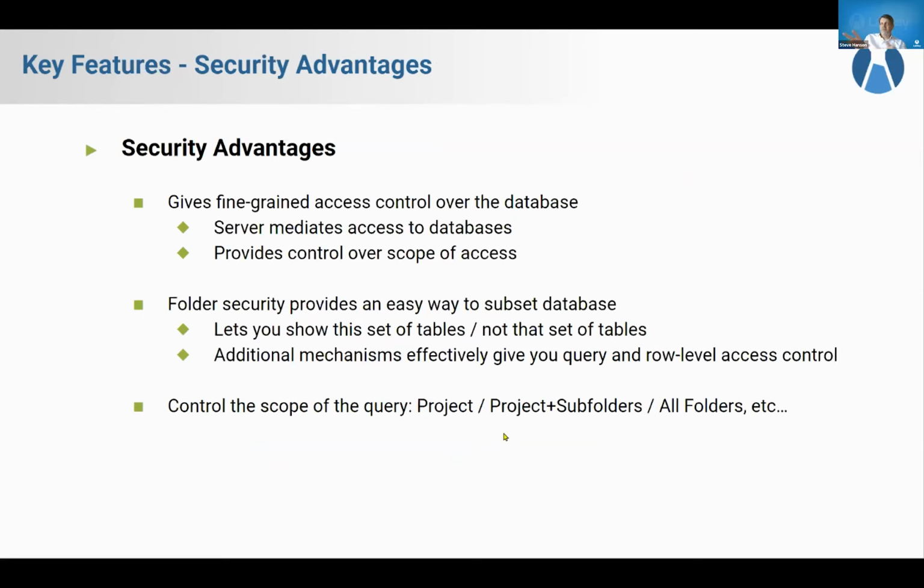LabKey SQL in combination with the server UI gives you really fine-grained access control over the databases. The server UI acts like an intermediary to the databases. So you can control who can see into the databases. You can require that people log in before they can see anything out of the databases. And the folder security framework provides an easy way to subset data in the databases. So you can say, I want the users who have access to this folder to be able to see these groups of tables, but not those other groups of tables. That's already an enormous advantage that you're getting with LabKey Server.